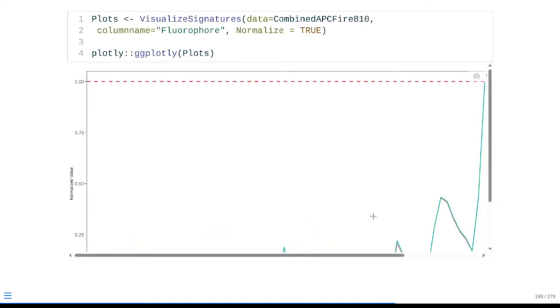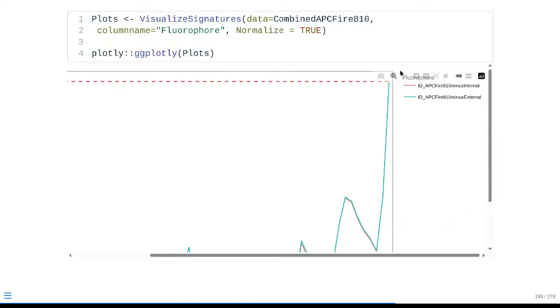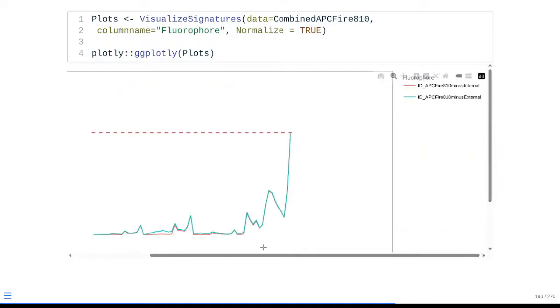And if we check the normalized signature to actually see the between 0 and 1 values, we can see a similar story. It's relatively minor by appearance. We'll actually evaluate how to compare signatures with each other next time.